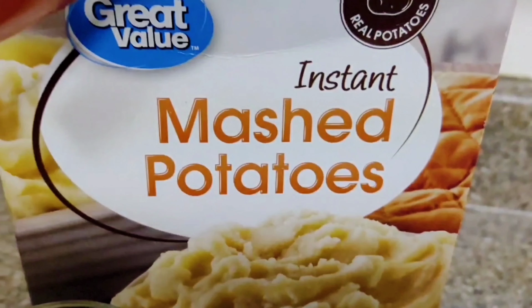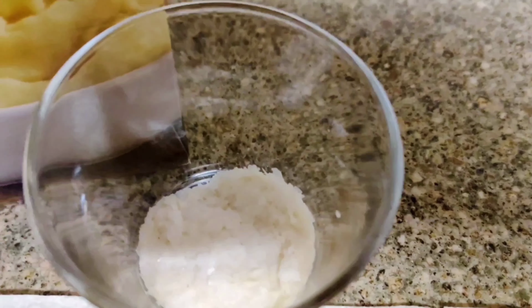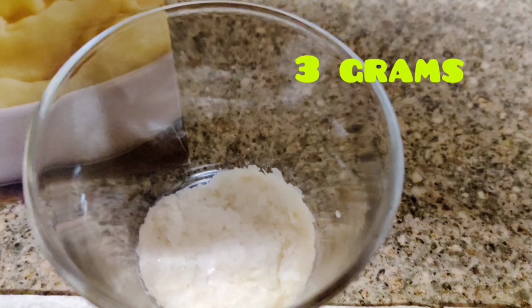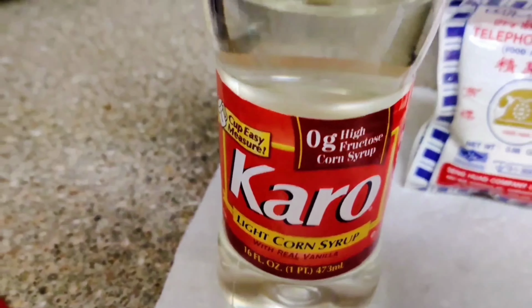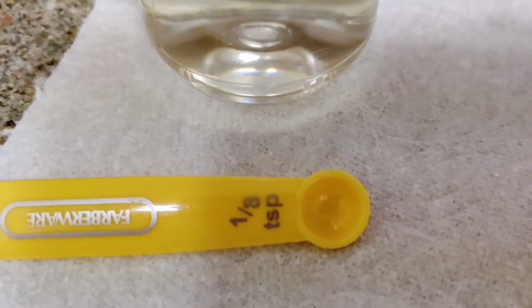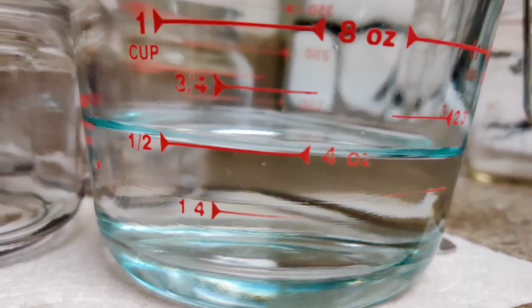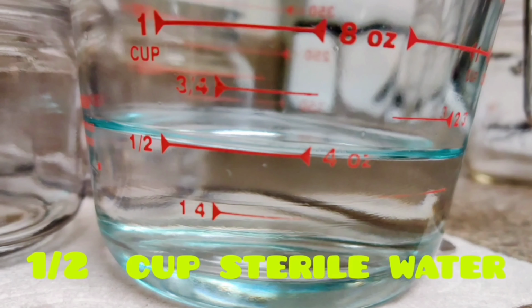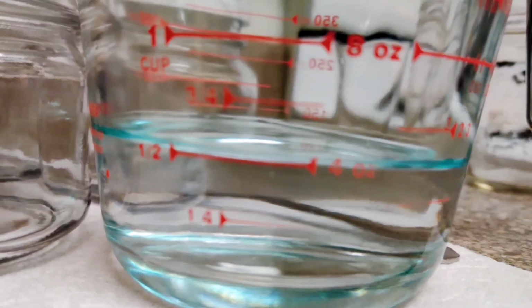Instant mashed potatoes. One gram of corn syrup is equivalent to 1/8 teaspoon. And a half a cup of water. I warmed up the water a bit in the microwave to help the corn syrup dissolve.